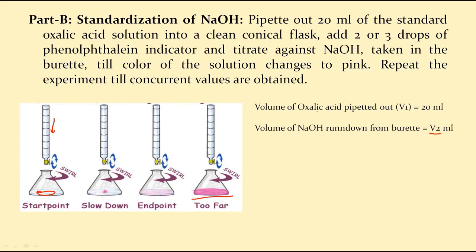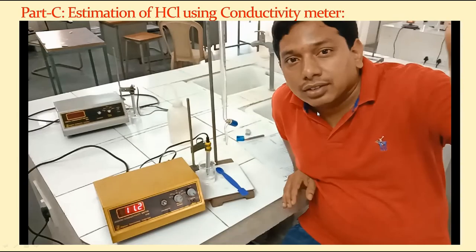This is part B. Whereas part C is the estimation part in which we are going to use the instrument.